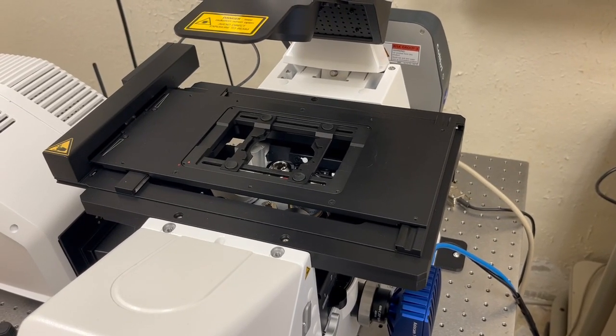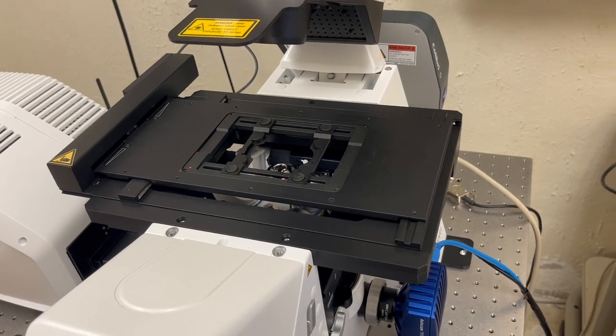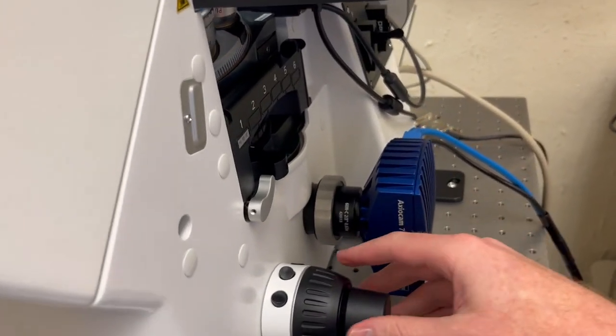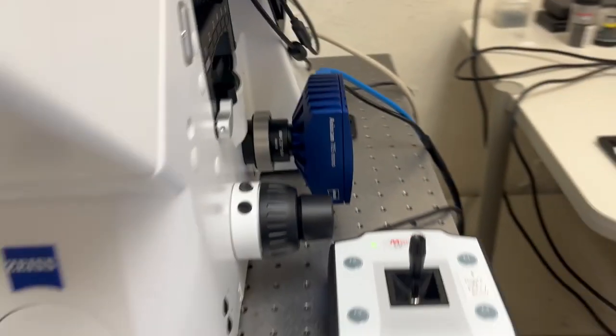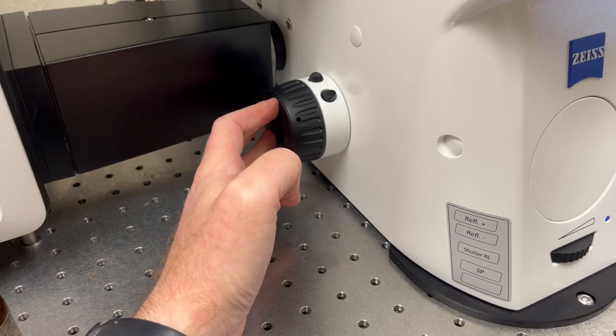In this video I'm going to describe the operation of the focus knobs and joystick on this microscope. To focus on the sample you will move the focus knobs by turning these two wheels, or this wheel and this panel inside it with the divots.